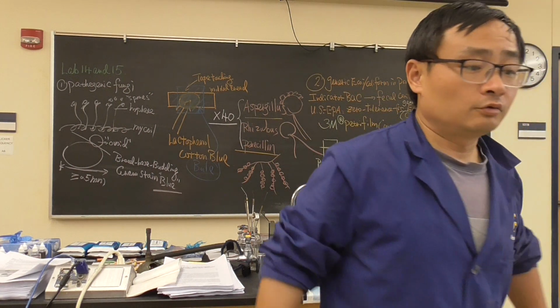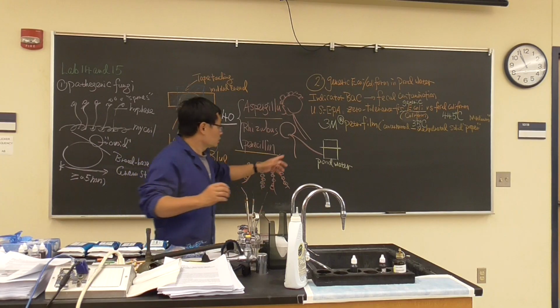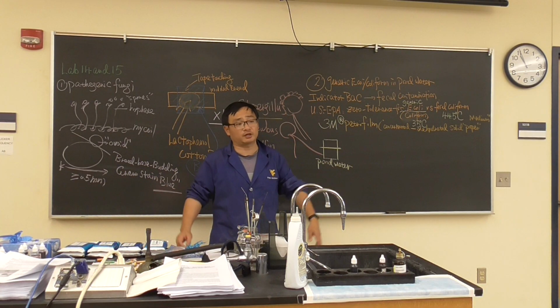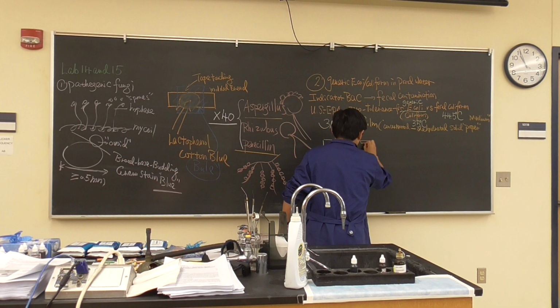Okay, what's the job we wanted to do? We want to see if there is coliform and fecal E. coli. So what do we do? Because we're not assuming this pond water has a very huge amount of coliform, same thing, we're going to prepare 2 dilution tubes. This will be 9.9 ml, 9.9 ml.